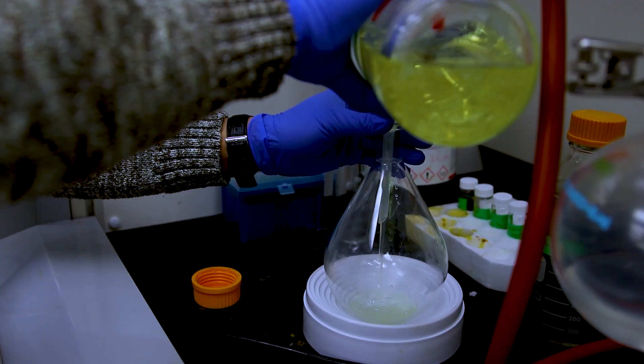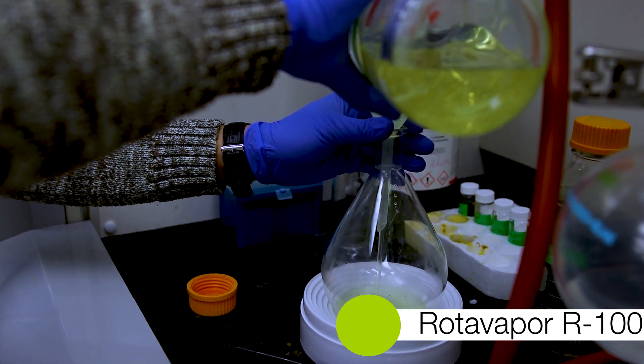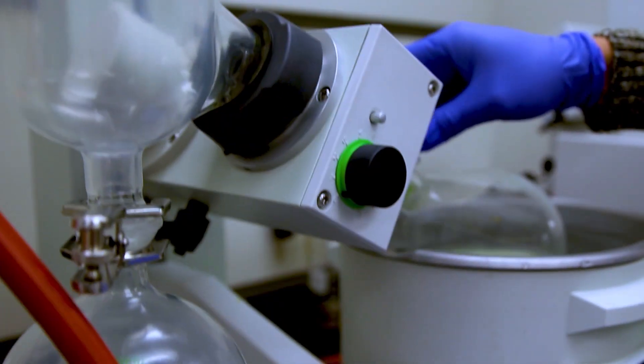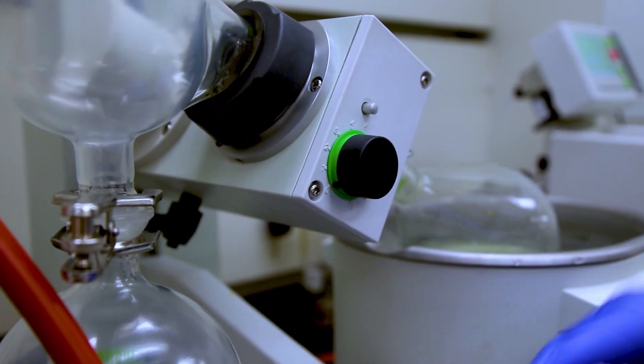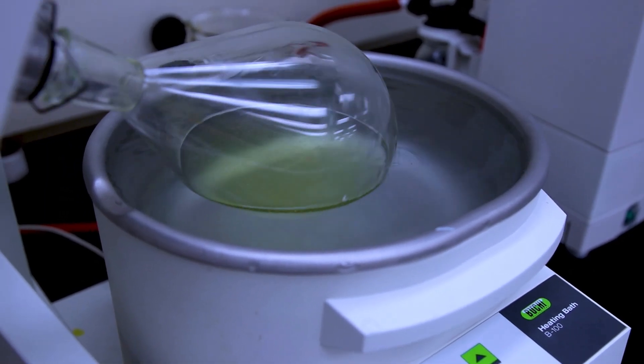We have three instruments in the laboratory. I'll probably start with the Rotovap. Right now, when we're working with natural products and certain types of compounds using organic solvents, whether it's acetonitrile, chloroform, or methanol, it's an easy way to help clean up the compounds that we're working with in a fume hood to make sure it's cleaned up properly.